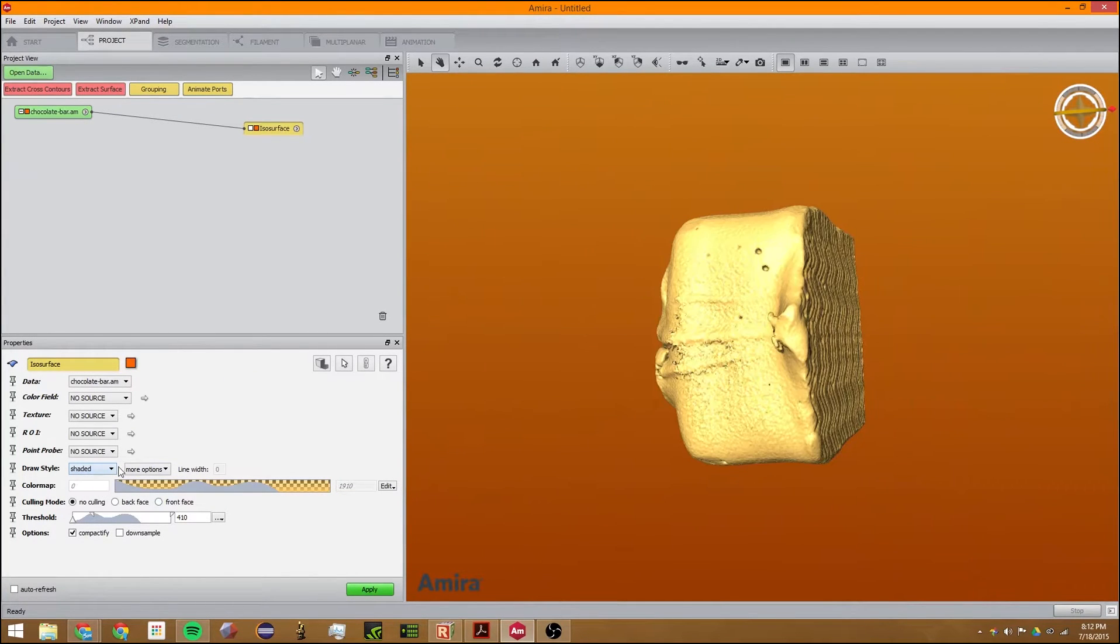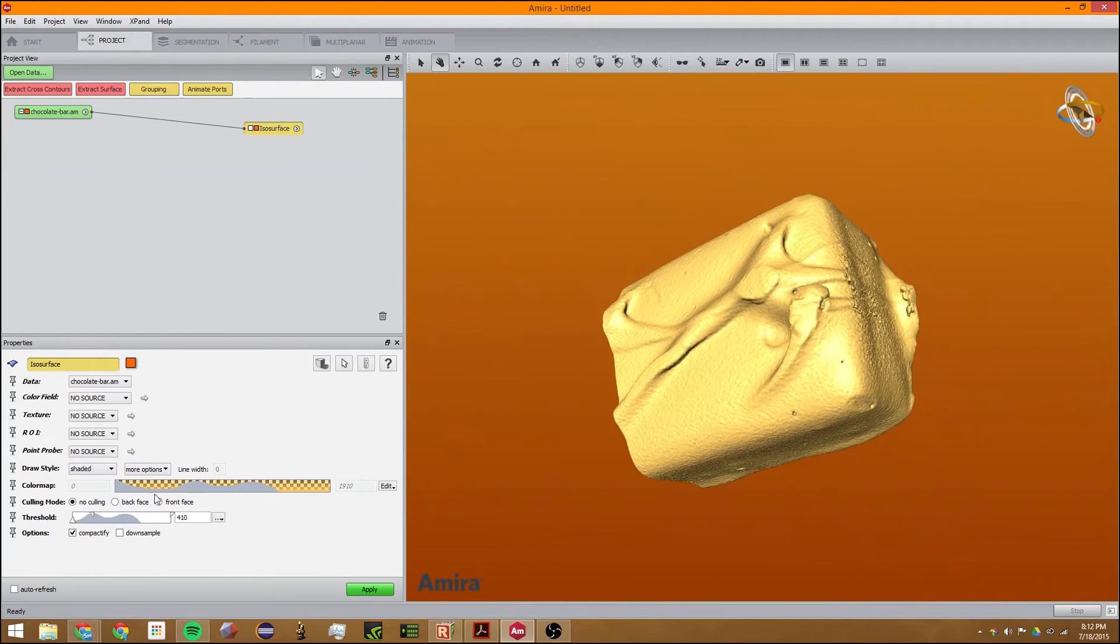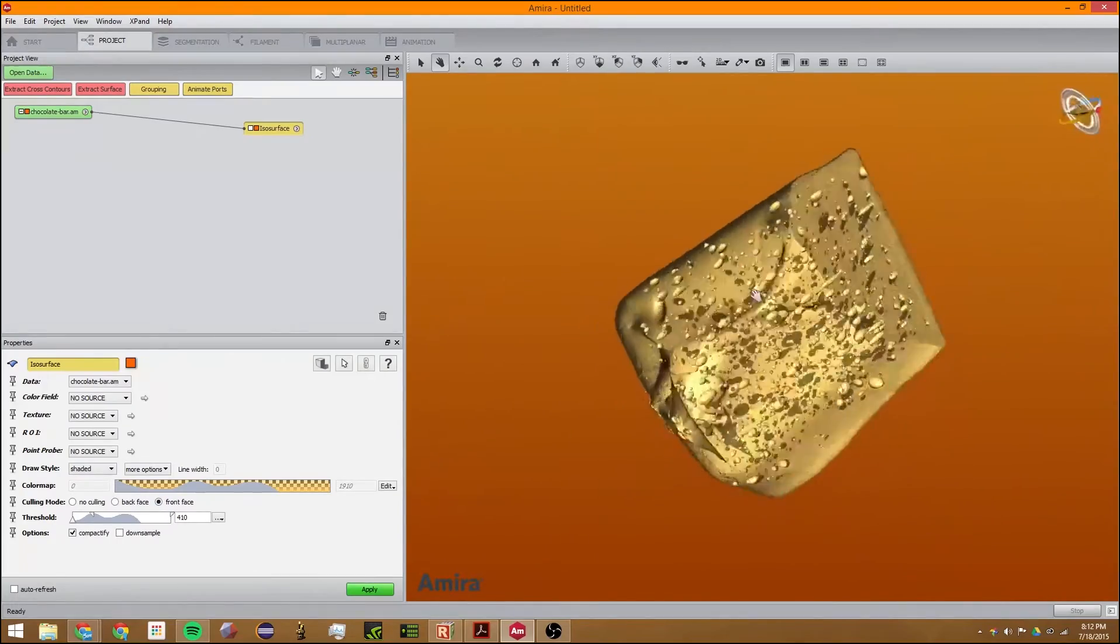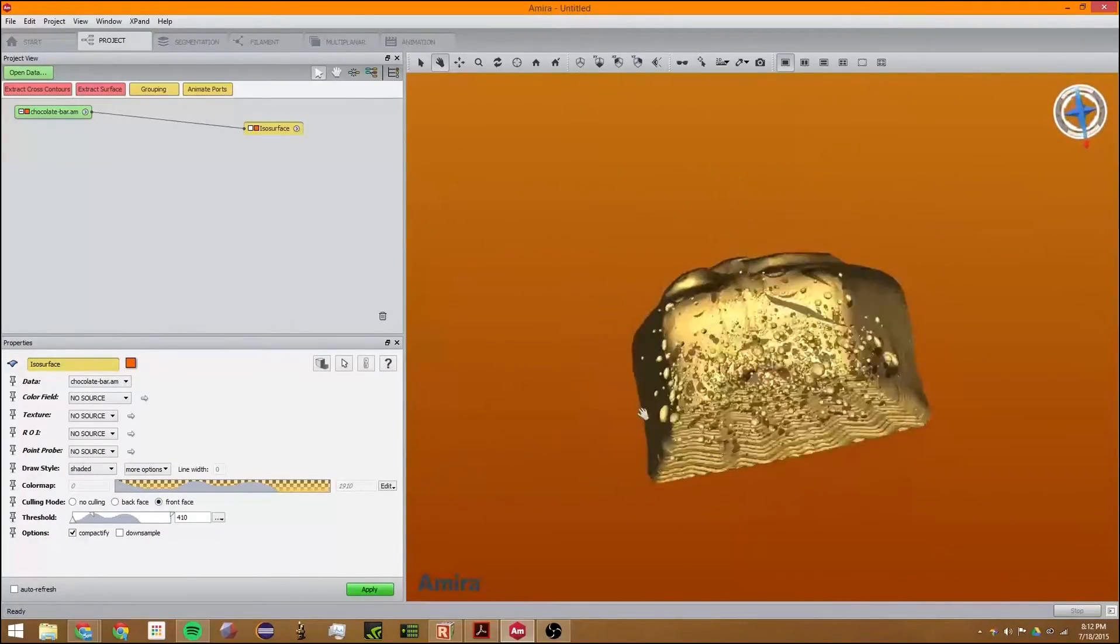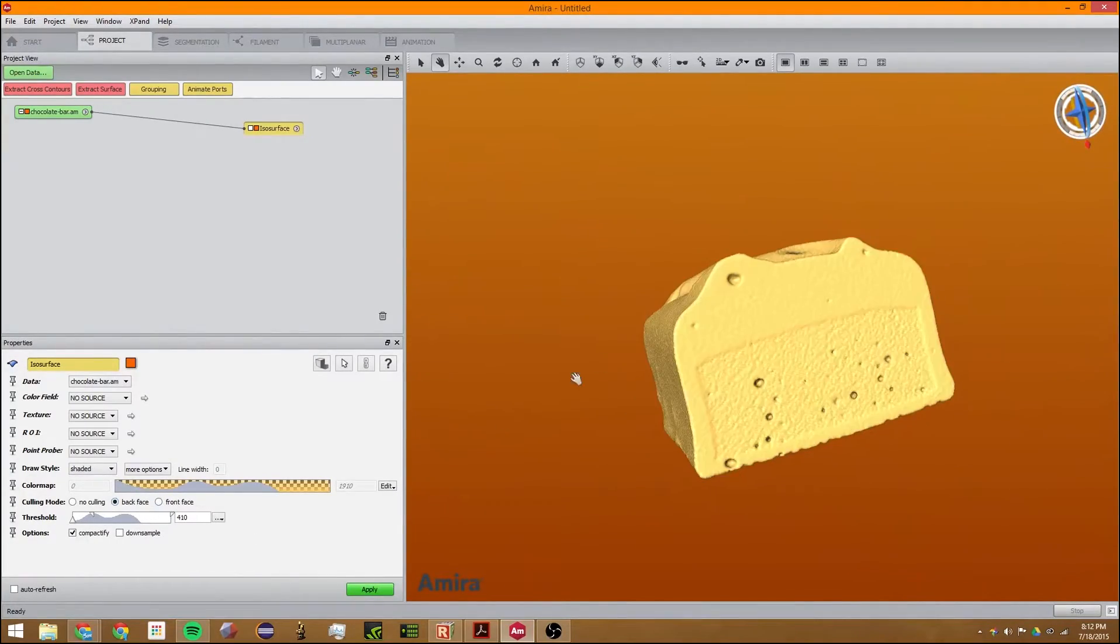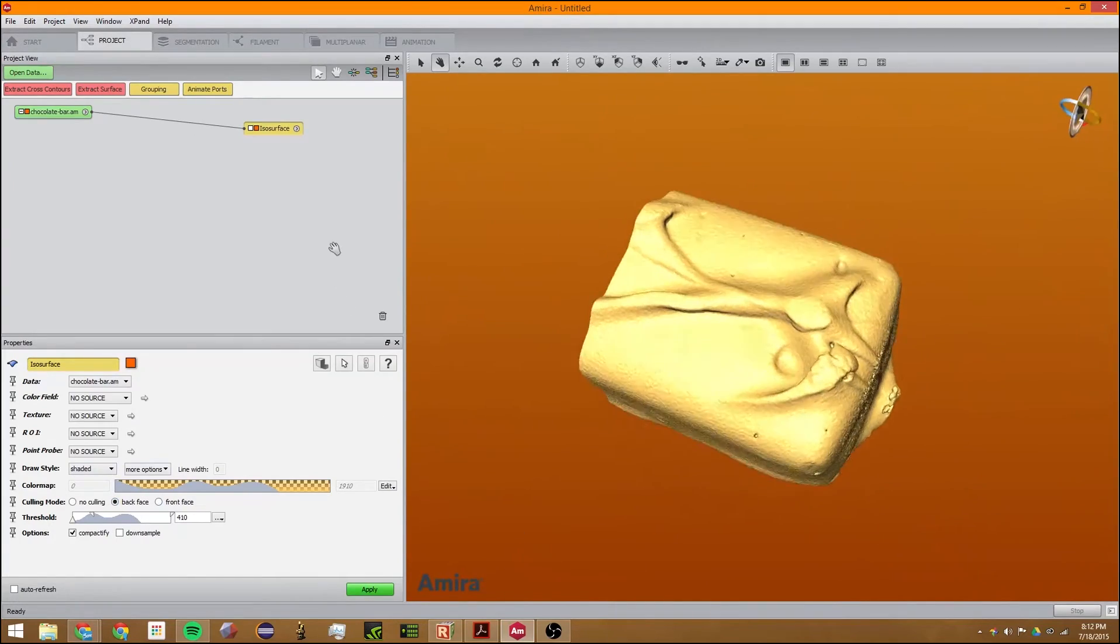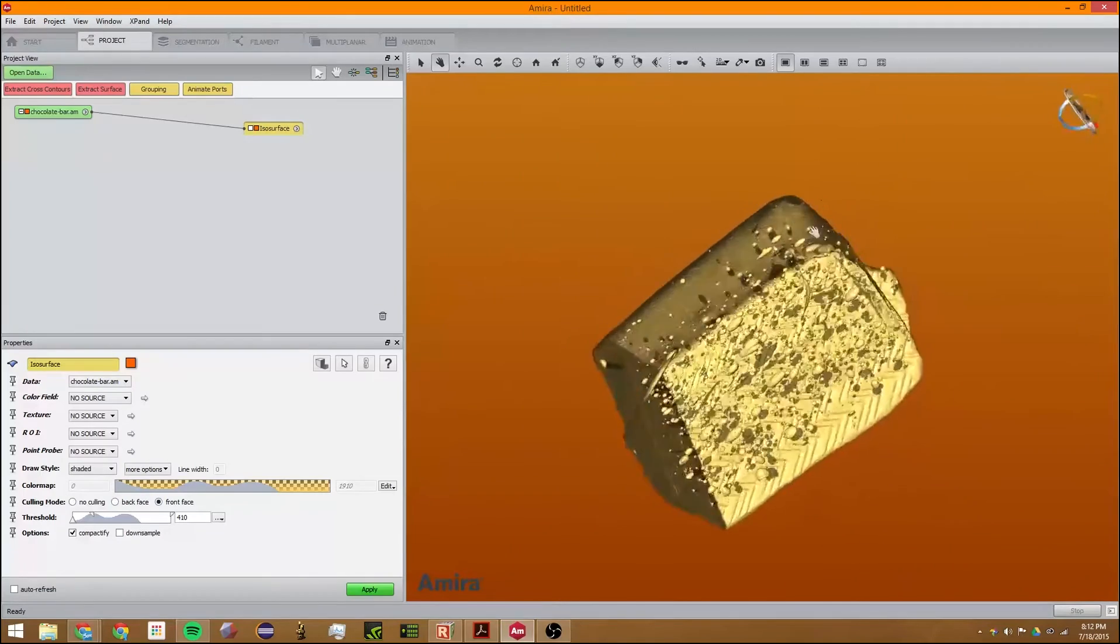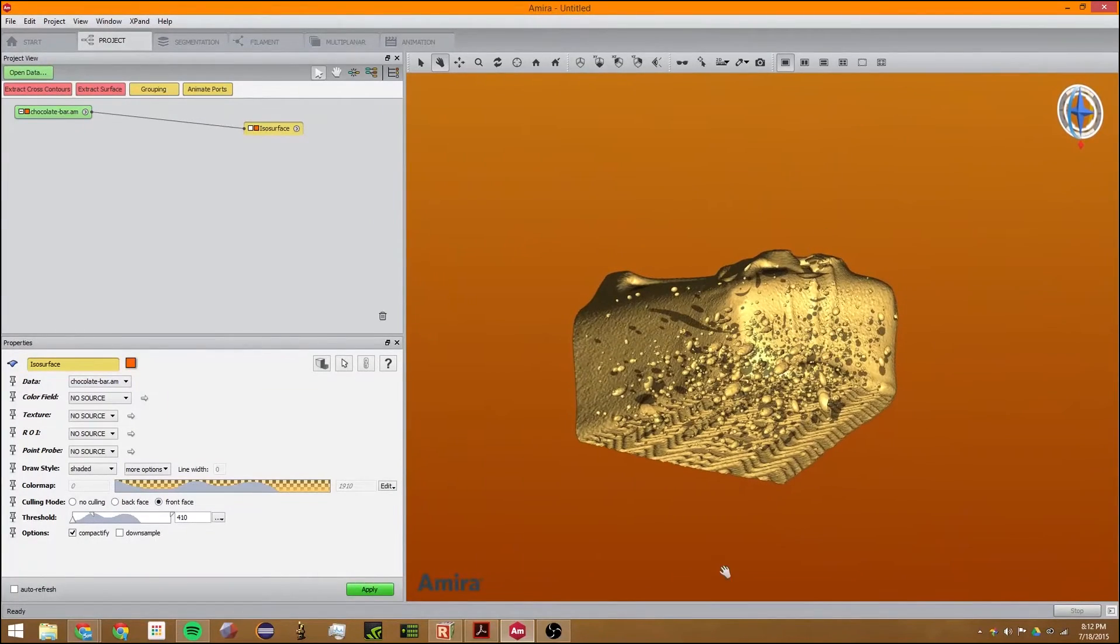You can change the draw style from outlined to shaded, which is the default. You can also cull different parts of it, the back face or the front face. The back face would cull what's behind the camera, which you can't see right now, but the front face would cull what you can see, so we can see inside.